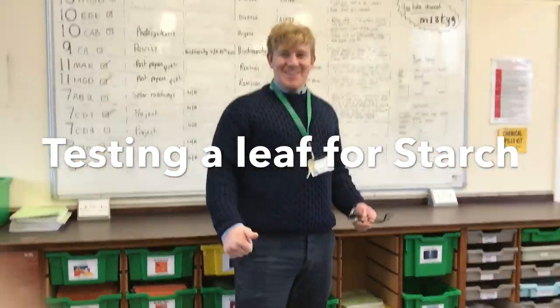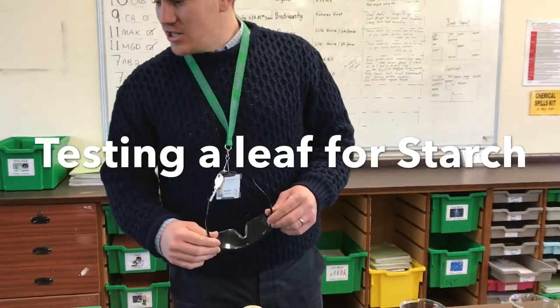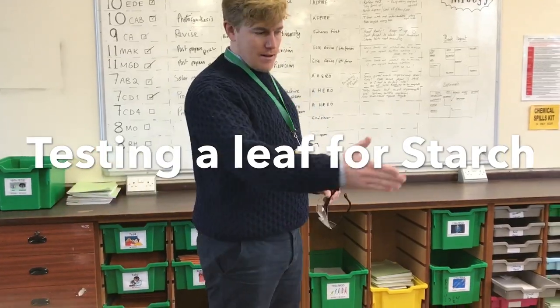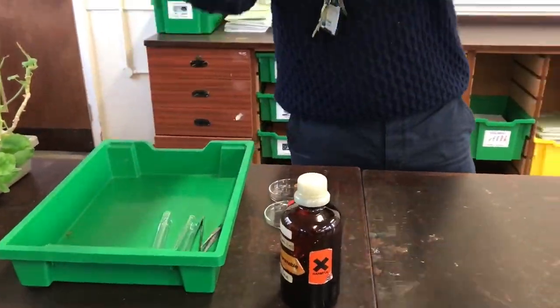Welcome back to our YouTube channel. Here we are with year 10 science, and we're going to find out whether there is starch in a leaf by looking at whether it's been left in the daylight or in the dark. Don't forget your safety.